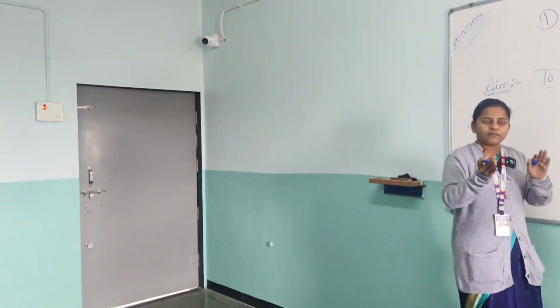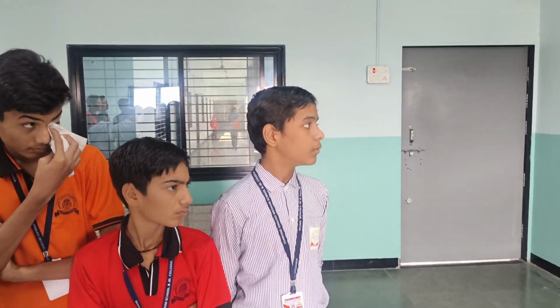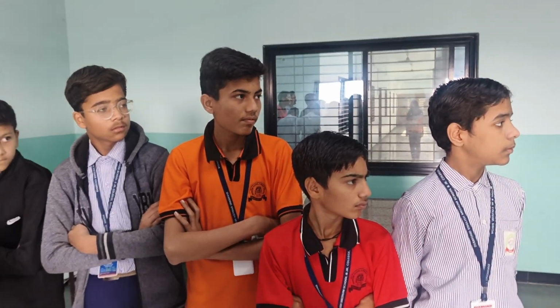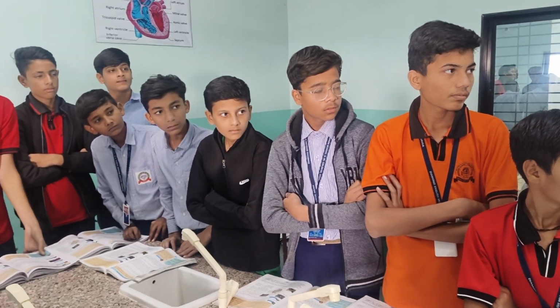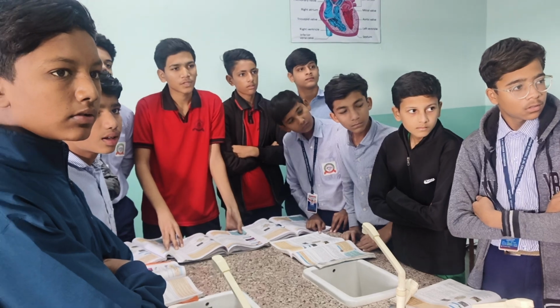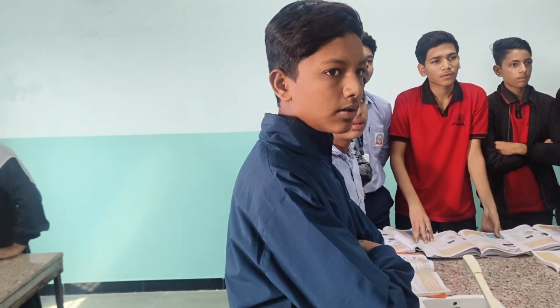Then we remove the extra curd and extra methylene blue, and put a cover slip on that smear. We have made a smear, and we have to see that smear under the compound microscope.